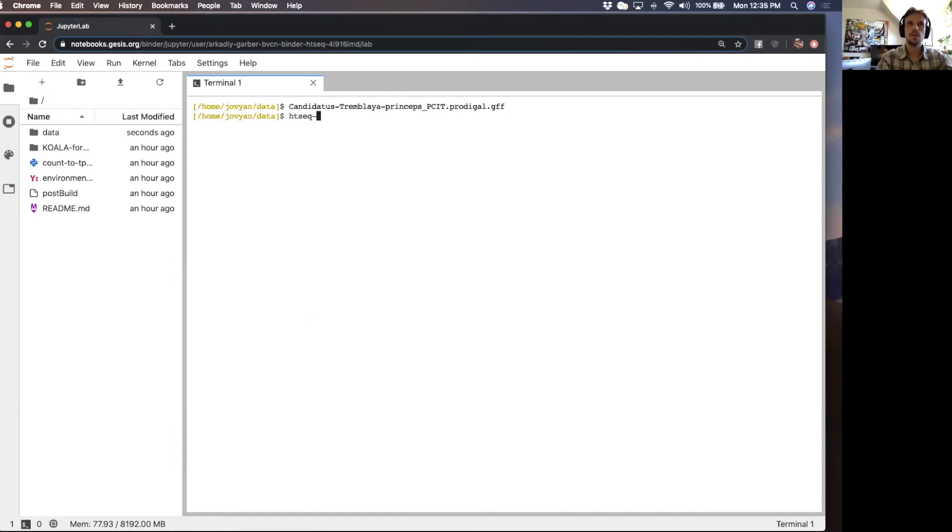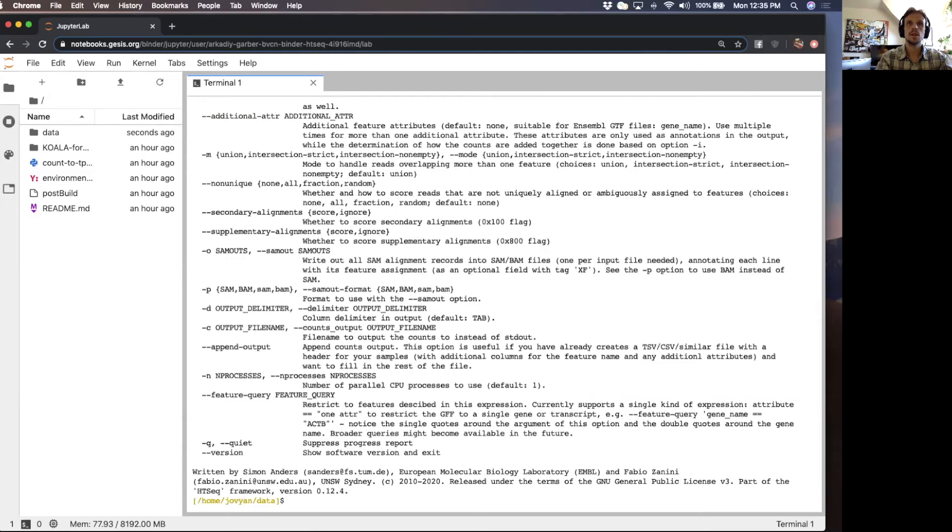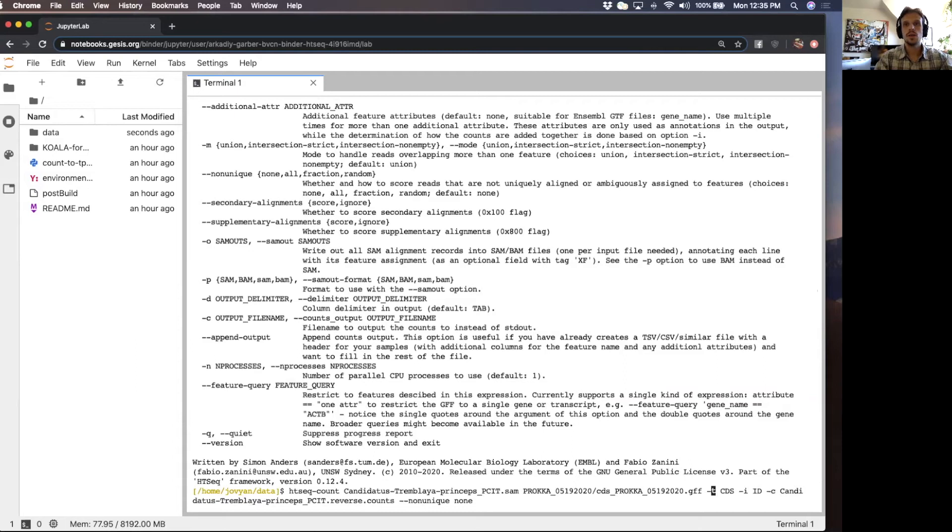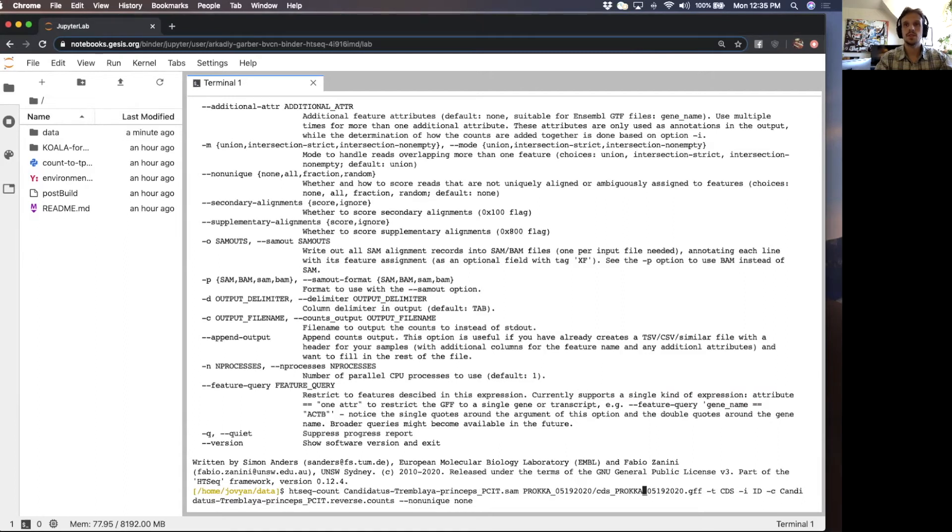I'm just going to print the HTCount help menu just to have it up. And I'm going to copy the command. Here we have the program. First positional argument is the SAM file. Second positional argument is going to be the GFF file.